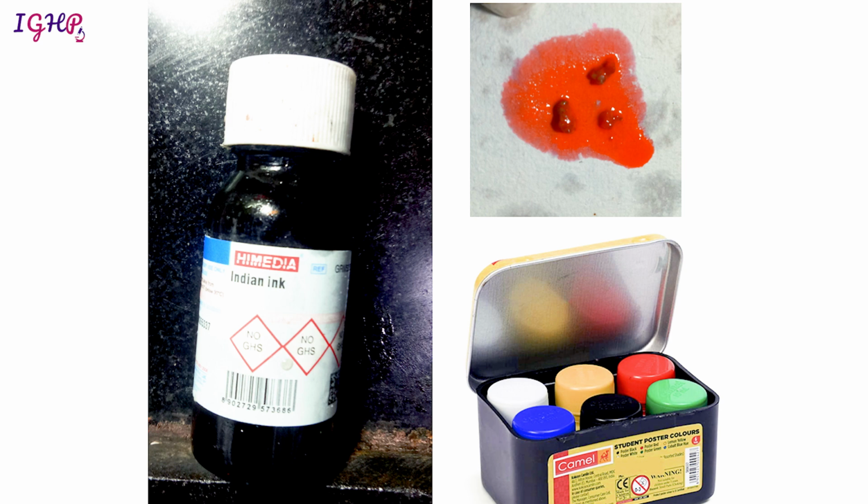Now that we know the different phases of the tumor, and we have talked of how you should approach these specimens, the next important thing in grossing is inking of the specimen. How should I ink the specimen and what inks should I use? First, if you are seeing a small biopsy, when you put the bits on the tissue paper, put some drops of eosin, so that when the technician does the embedding, these bits are easily identifiable.